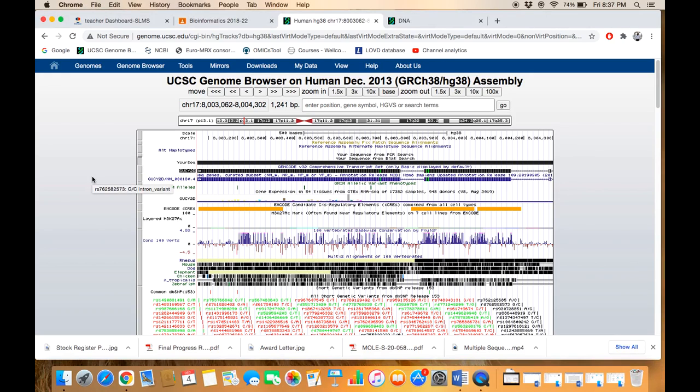It's a multi-purpose tool. On one hand, it determines which gene your query sequence belongs to and on which chromosome that gene is present. On the other hand, the same tool is also used for sequence alignment to find mutations.